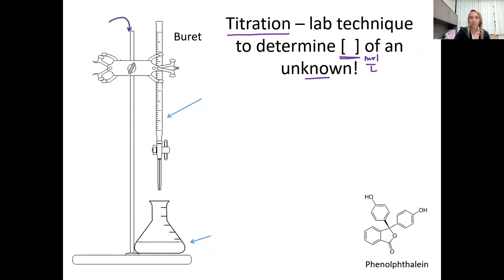We basically have a ring stand, which is a pole on a heavy base. And this is a special kind of clamp to hold a burette. Now, a burette has graduations that you can read, kind of like a graduated cylinder, except instead of dumping out of the top, we turn this stopcock, and when it's vertical, the solution up here drips out into the flask below. When it's horizontal, it doesn't drip. So in this burette, what I usually have is something I know.